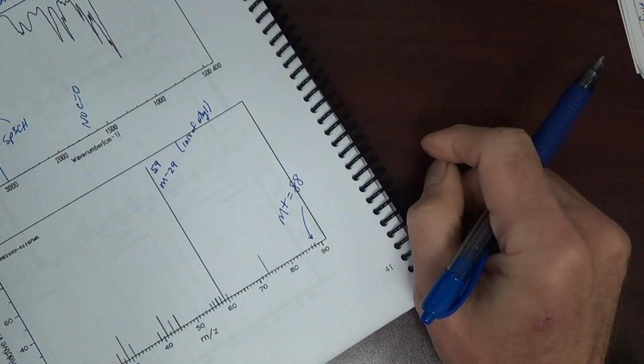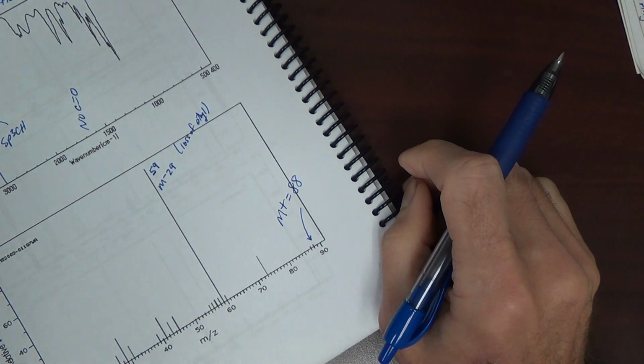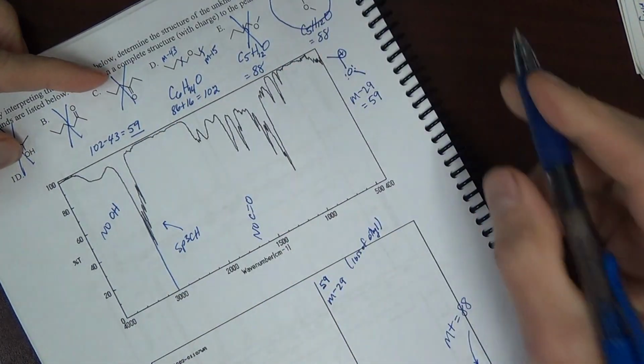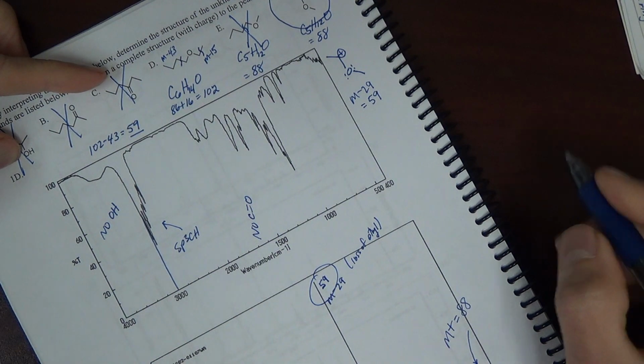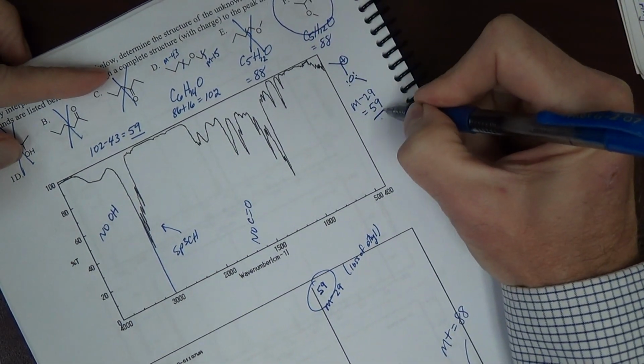Okay, I went on with that for a little bit. Ultimately, though, it boils down to we can exclude these three pretty quickly. The only one up there that you would expect a 59 from, well, that's not quite right. 88 and a 59.